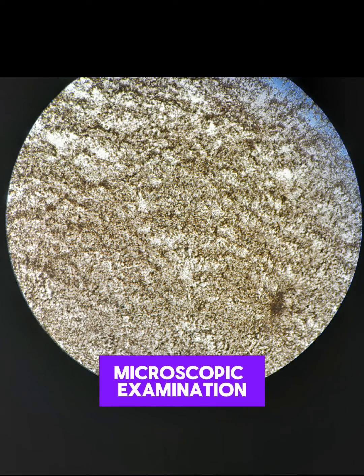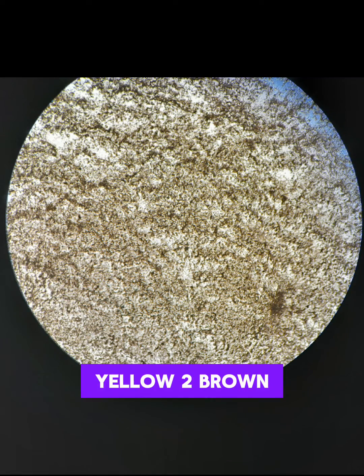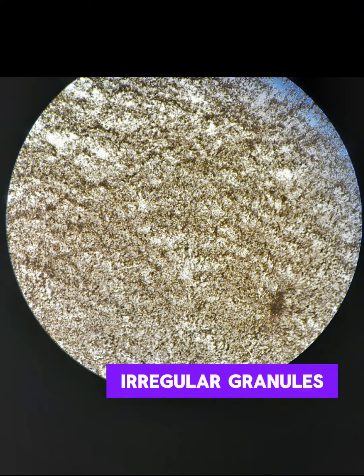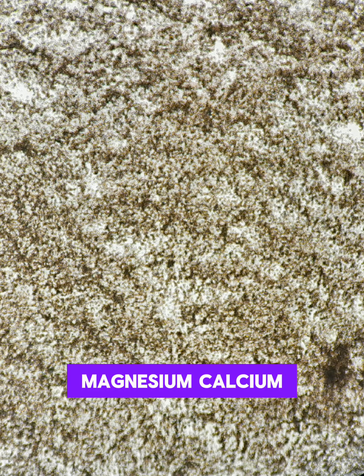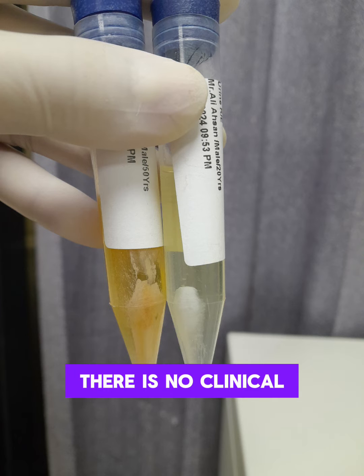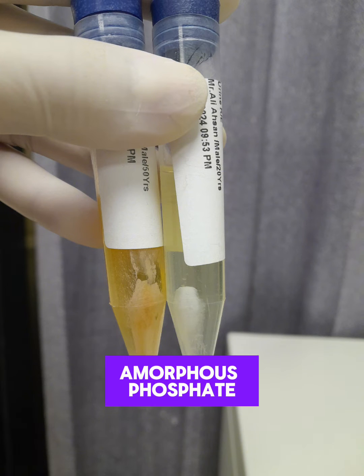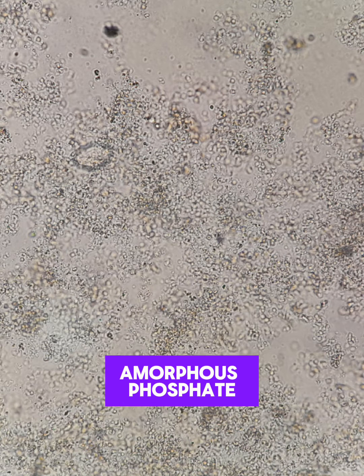Microscopic examination: yellow to brown irregular granules, which are formed from urate salts of sodium, potassium, magnesium, and calcium. There is no clinical significance of amorphous urates.